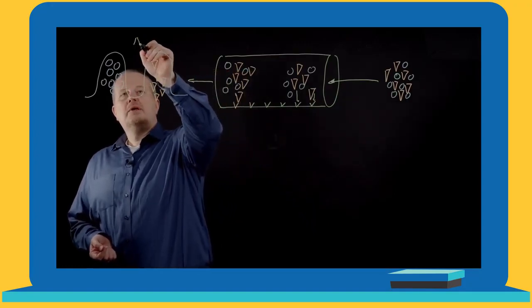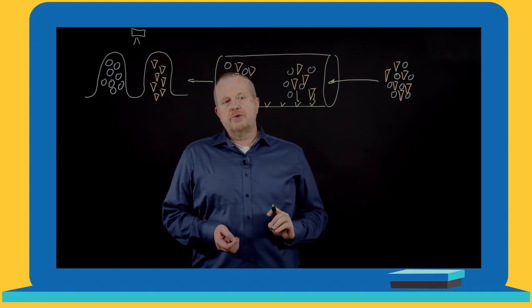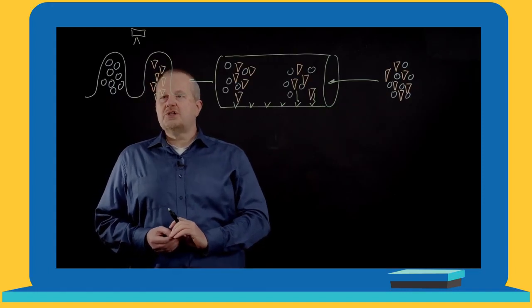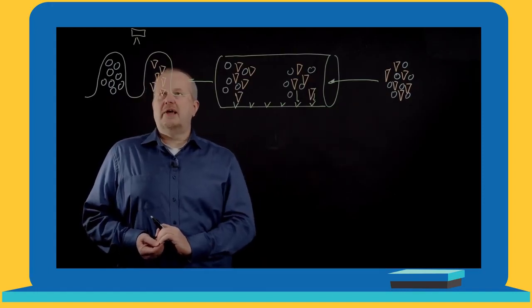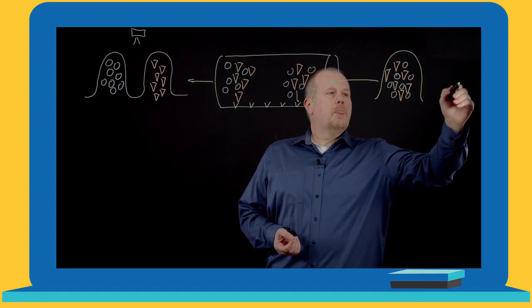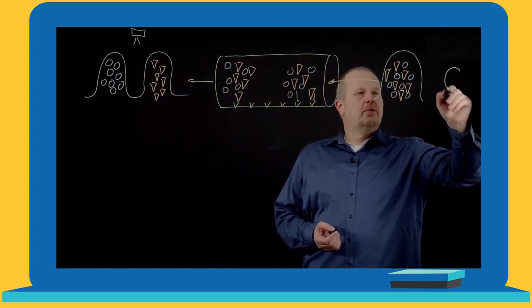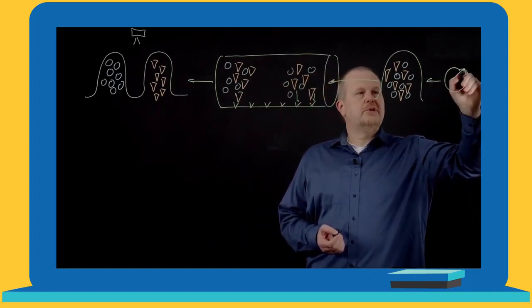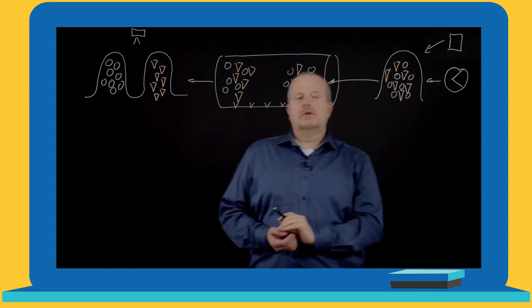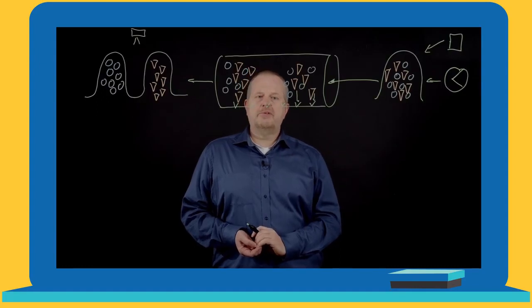In our system, we call these peaks, because we have a detection system, which is typically a UV detector. This UV detector cannot discriminate between the two different particles, but it can give us a quantitative expression of how much UV light is absorbed by the system. So when we start here, we have the mixture. And to make our chromatographic system complete, we need something which pumps the mobile phase through the system. So here we need a pump. And we need something where we introduce our mixture to be separated.